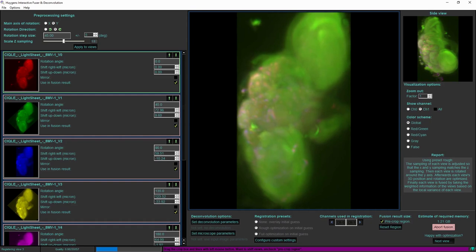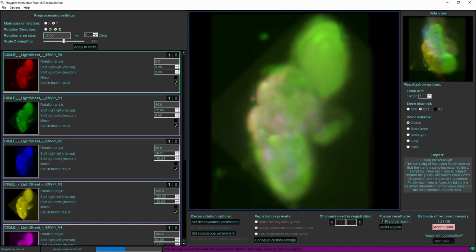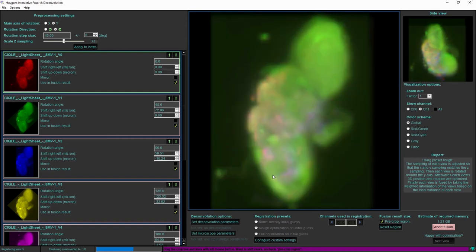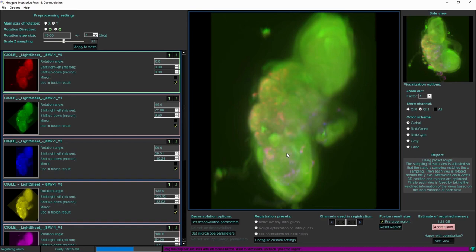It will do that automatically and then we see the overlap view slightly moving. That means that Huygens is attempting slight variations on both the position and the orientation, so it is a rotation and a shift that it is attempting to optimize for each of the views. Once it does not change anymore and it has found the optimal position it will combine each of the views into the fused image.